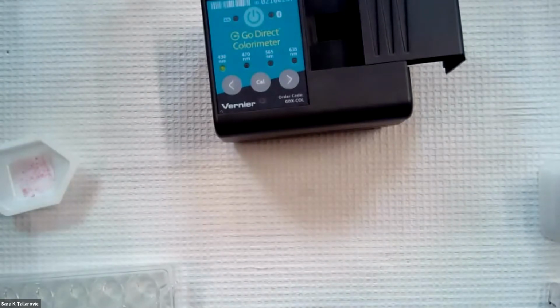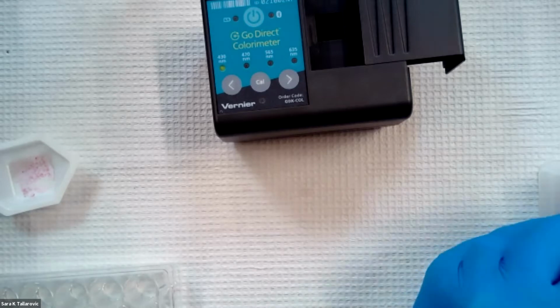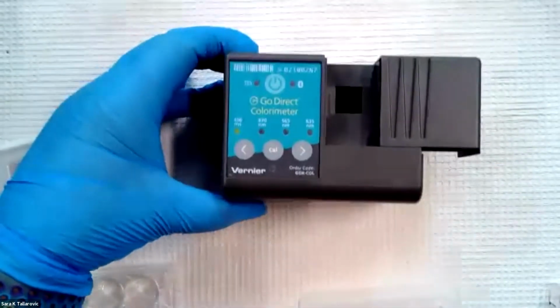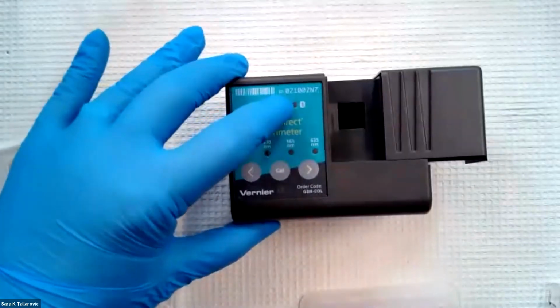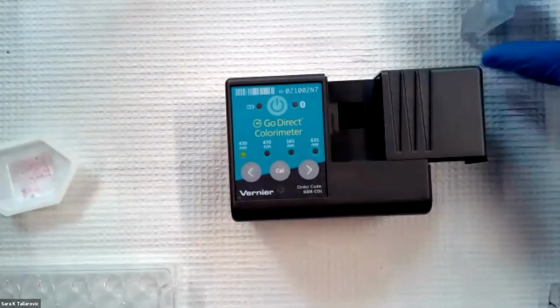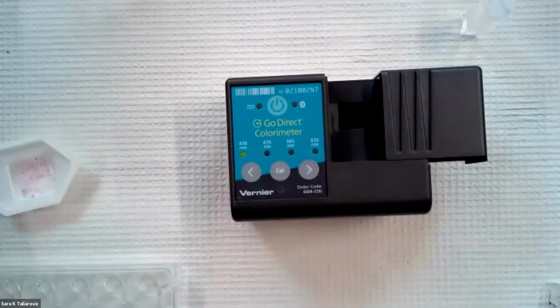All right. I'm going to show you a number of different explorations that you can do with this lab today. I'm going to switch views and get my colorimeter ready to go. That means I need to launch graphical analysis, so I'm going to start the graphical analysis software.